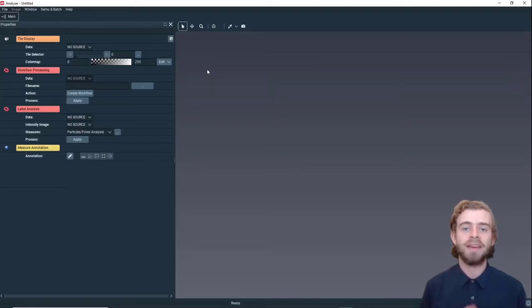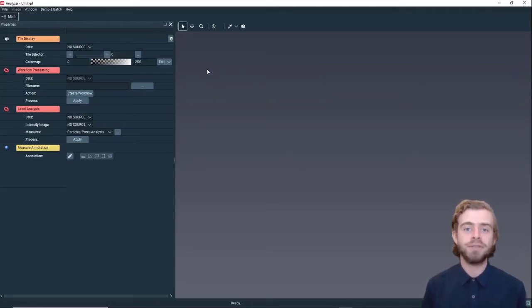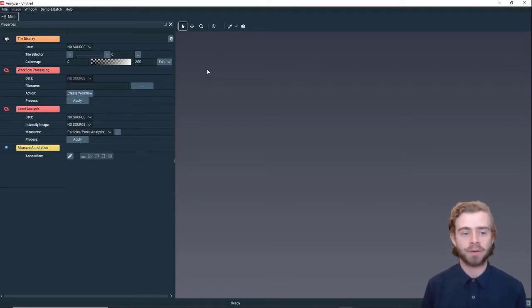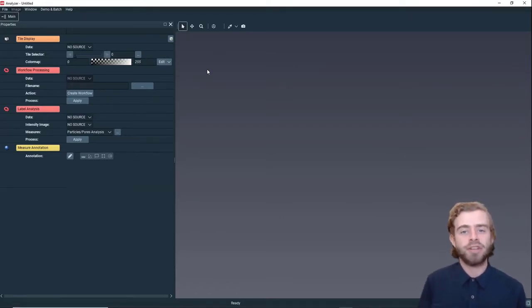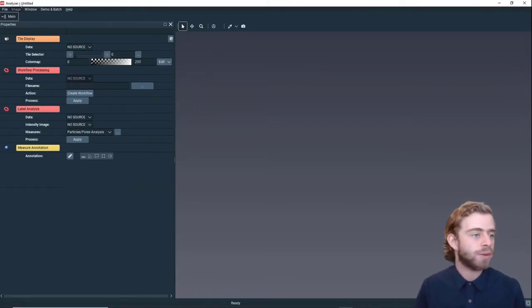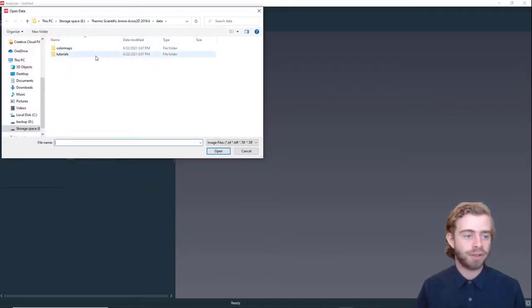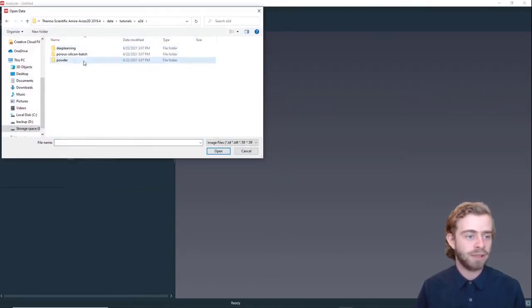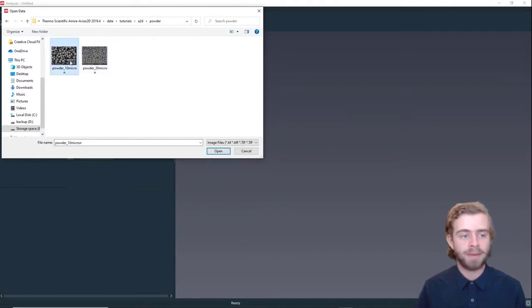Hi, my name is Sam and in this video we're going to go over an intro to Aviso 2D and how to use the image stack processing workroom. To start out, let's open some data. We're going to go to File > Open Data and go to Tutorials > A2D Powder > Powder 10 Micron.